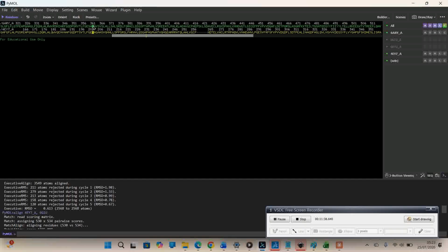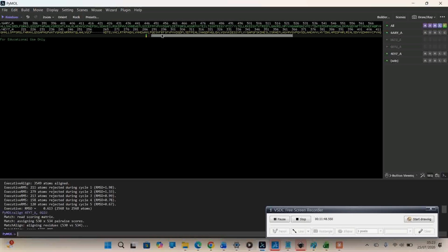And then by the time you map the particular amino acid, when you draw your grid coordinate around it, now check to see. So it's just something you do out of understanding, and it will be very useful in explaining the molecular interactions between the ligand and the enzyme, especially if you're using the same ligand for both structures. Once you draw the grid, you see that the matching amino acids, like I've been emphasizing, coming from the fact that you have the same enzyme structure.